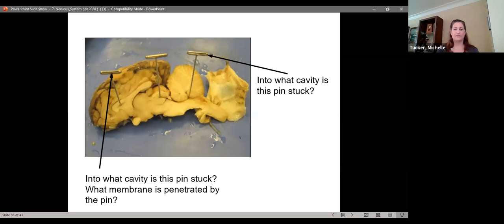So this is looking at ventricles again. So go ahead and put a heart at the fourth ventricle, an arrow where the cerebral aqueduct would be. Yeah, very good. I didn't know you were going to get that one. And then go ahead and put X's kind of where you think the third ventricle should be. And it continues down. It's going to continue down and around the thalamus. And then a question mark at the lateral ventricle. Yep.